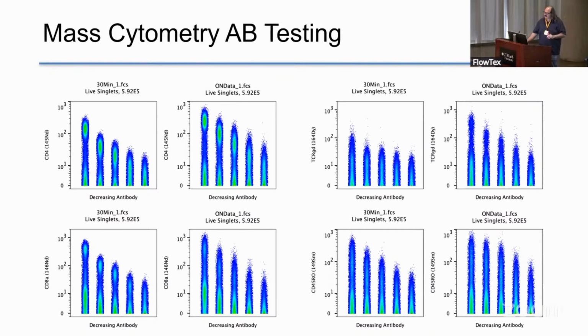So this is actually kind of similar to the idea of how the tandems got stuck to macrophages. And I'm curious how the different polymers in the BV series are aggregating. I'm curious if we could convince Standard BioTools to come up with something that allows less of that excessive binding, even if it's just blank polymer. I have no idea.